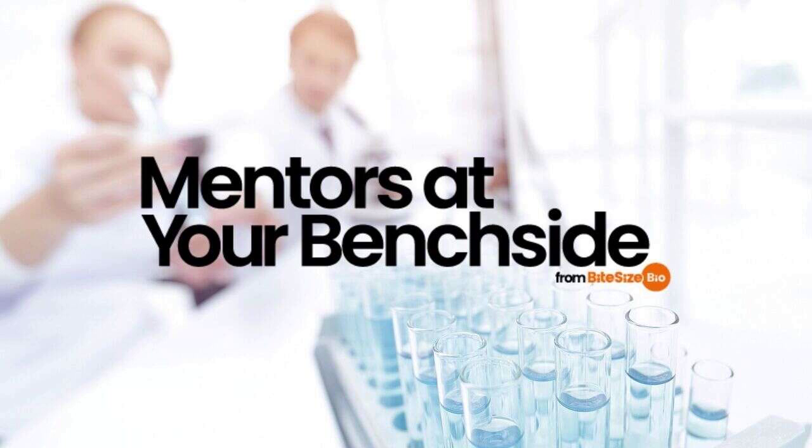Number 3, culture oversaturation. You will always get the best results by taking care in preparing the culture. Inoculating from old colonies or allowing the culture to become too saturated will result in poor plasmid replication and retention, which could severely affect the plasmid yield. Growing cultures overnight may seem time efficient, but overnight cultures can easily become oversaturated and lead to low yields. You want your cultures to be in the late log phase and not oversaturated. Visit the original article, there is a link in the episode description, for an easy protocol for growing unsaturated cultures.